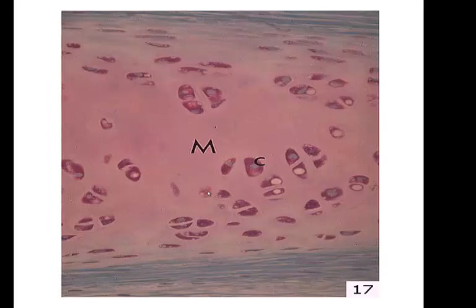Those are our only two pictures. So this is closer up, elastic tissue, and these are farther away. So the identification would be elastic connective tissue, and its classification would be connective tissue. Its location would be the aorta, or the ligamentum nuchae, if you want to put that down. But it's a very specific ligament, and it's spelled N-U-C-H-A-E, and its function would be recoil after stretching. So that is it for connective tissue proper, and we're on to our cartilages.